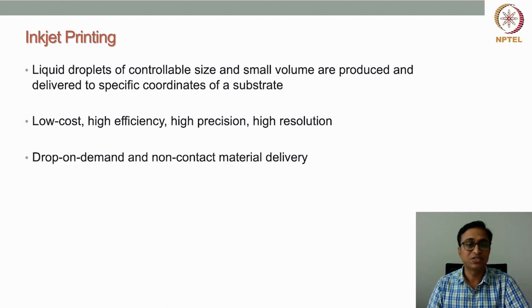So that's why this printing technology is highly popular because of all these advantages or characteristics: it is low cost, high efficiency, high precision, and high resolution.